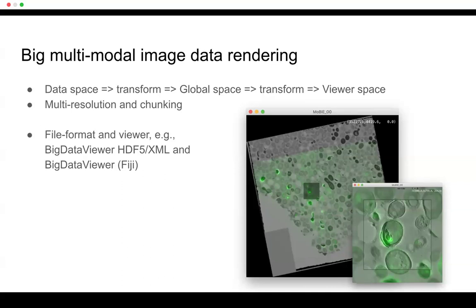And one very accessible example of this would be the big data viewer ecosystem in Fiji where the file format would be HDF5 for just the data. So this can support multi-resolution and actually also 3D chunking. And then an additional XML file which contains the transforms. And then big data viewer can read these two files and do the right thing. And then you can now see how one can beautifully render the data that I showed a couple of slides before on top of each other in the correct physical space.